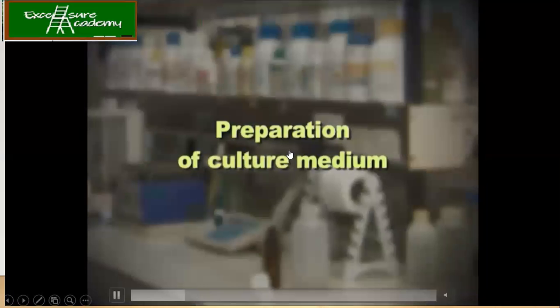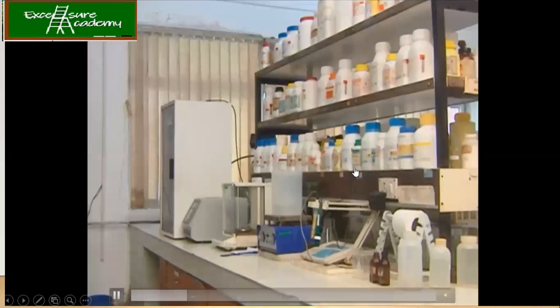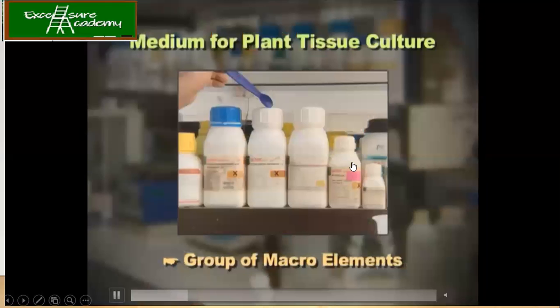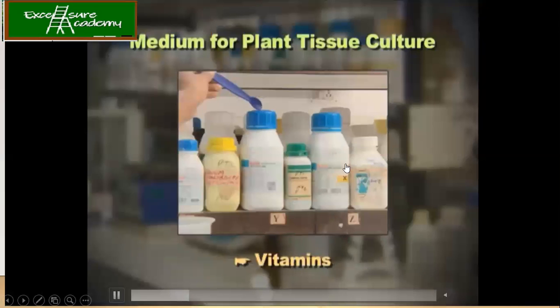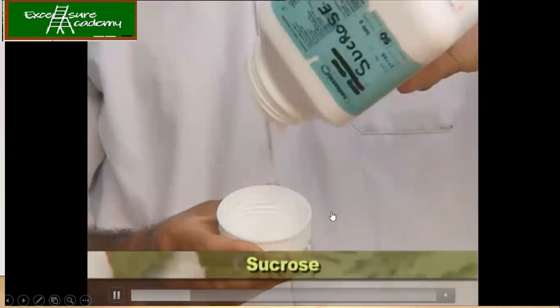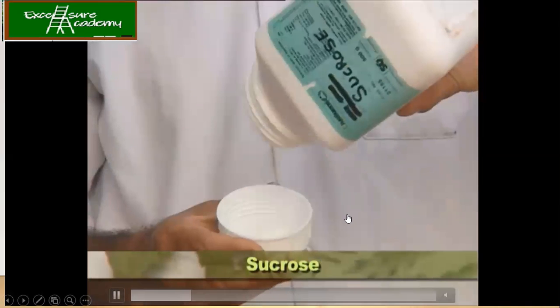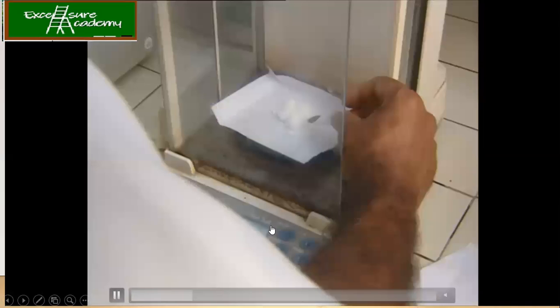Now coming to the culture medium. So exactly how you're going to prepare your media for the regeneration of the plants. You can see so many chemicals are present. We know that macro elements and micro elements are required, as we discussed in the previous lecture. Sucrose as the carbon source, you're going to weigh. Many people do it like this, or you can take a piece of paper, onto that you can also measure the amount required in order to make the media. Different people have different approaches.